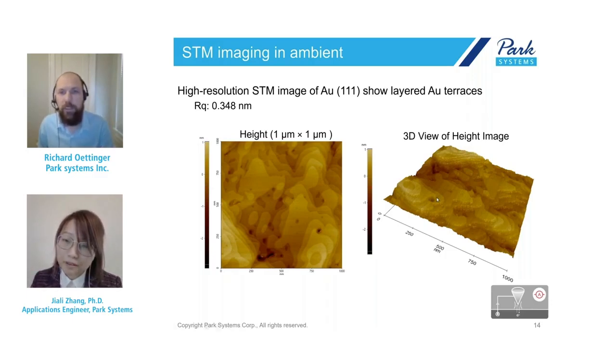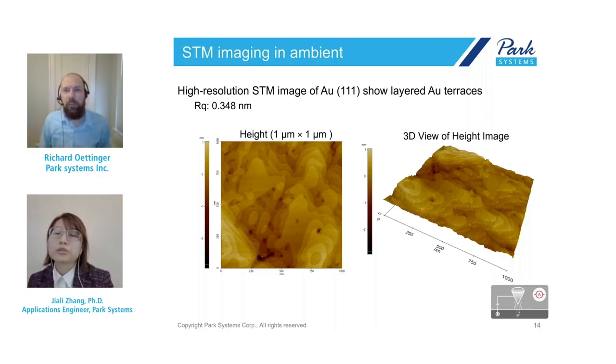All right, here's another question for you. How do you calibrate your scan piezo? By taking HOPG atomic images? If that's true, won't the calibration change with the change in tip length? We do have a calibration sample, but it's not what you stated.